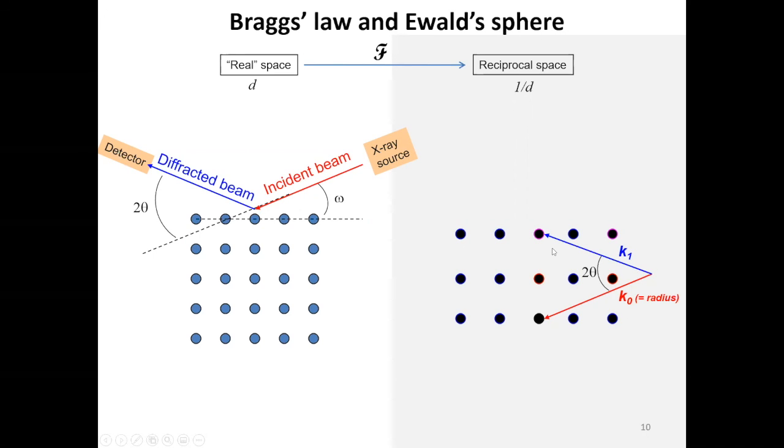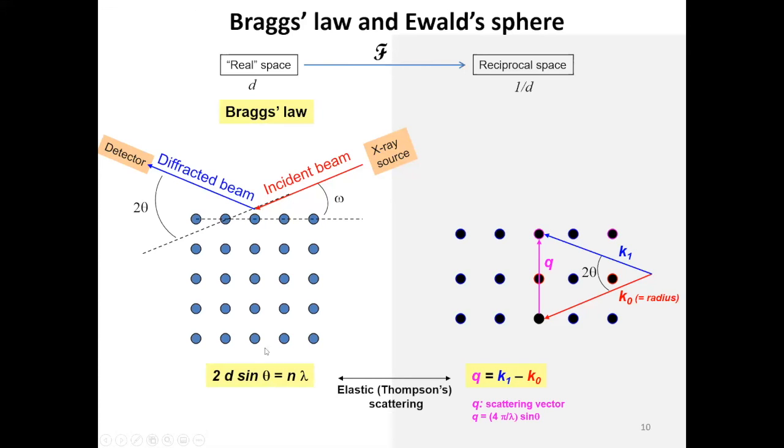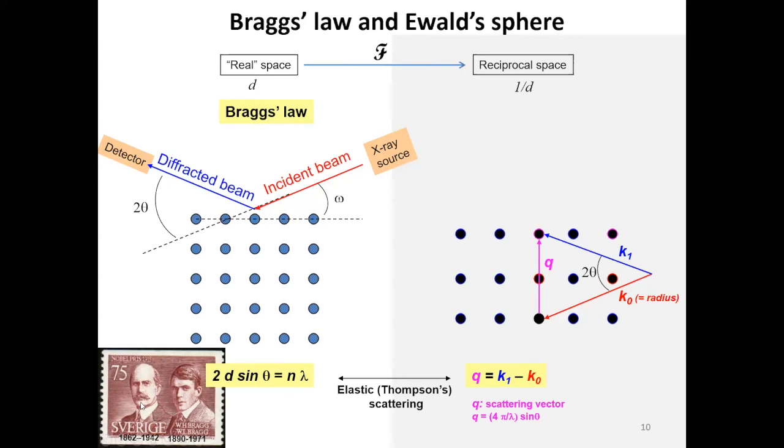The power of this technique is invaluable because if you know the wavelength of the radiation you are using for your measurement, and you can measure the angular position of the detector that's collecting signal, and you measure intensity there, you can go back through this equation and calculate something at the microscopic level, which is the separation between the atomic planes. This d-spacing, as we call it, is extremely powerful because it's a signature of the material and allows us to retrieve lots of different properties of the material.